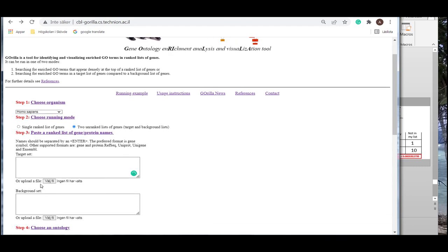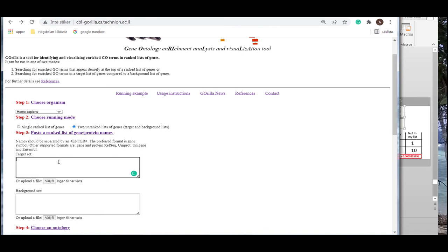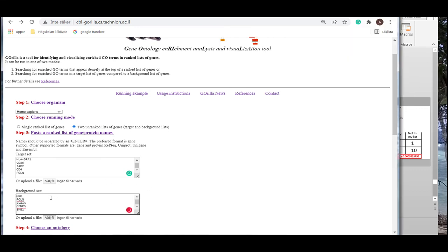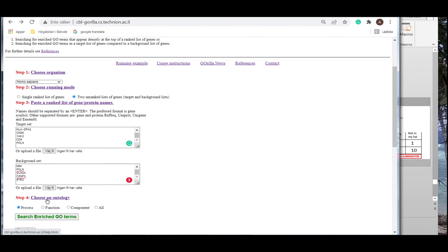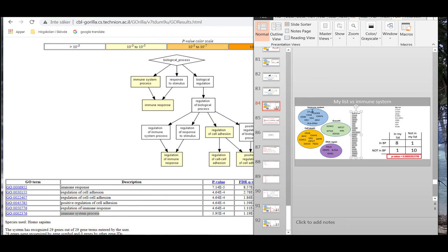You see that we have two boxes where the target set corresponds to my list, which includes the genes that were significantly expressed when the disease group was compared to the control group. The box for the background should include all the genes that were analyzed in our experiment, which correspond to the reference list in our example. We then choose which type of gene ontology category to use. We'll here only use the category biological processes. Next, we run the analysis.